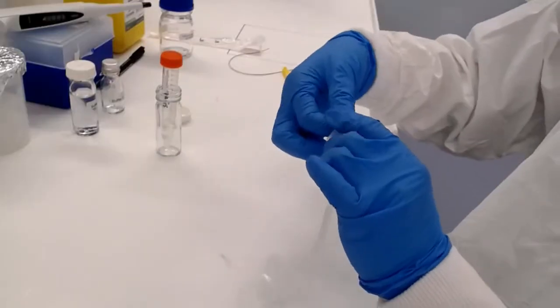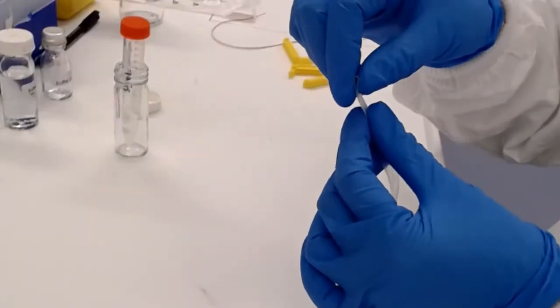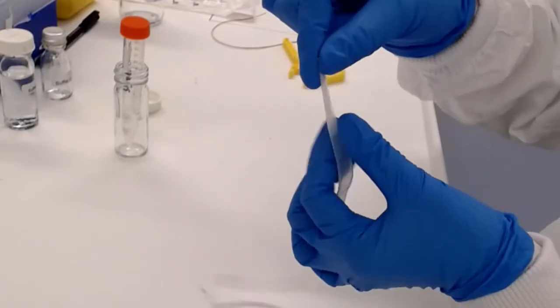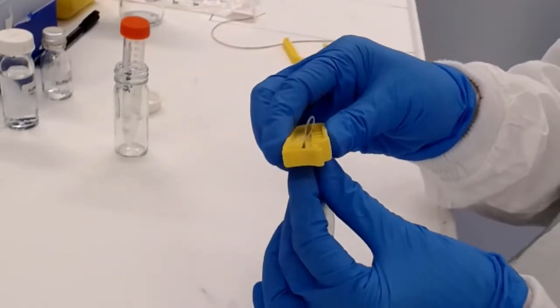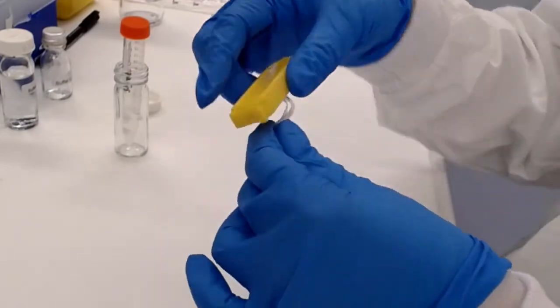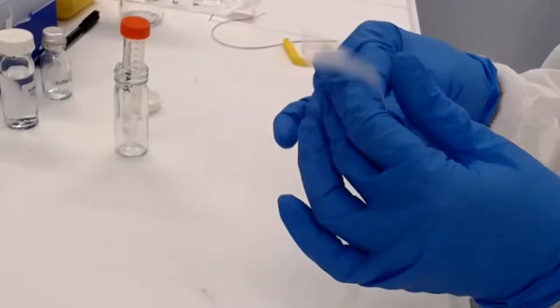Here's our dialysis tubing. This contains a membrane that has very small pores in it that are going to retain our protein on the inside, but the salts are going to go through into the outside solution. We double over the end of the tubing and clip it tight into one of the yellow dialysis clips.